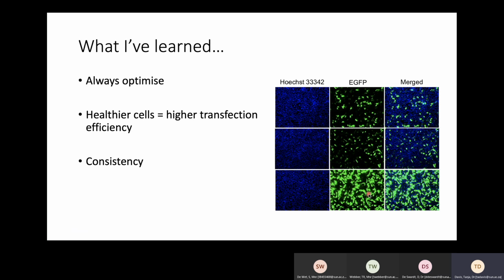Yes, that is actually one of the things that you would most likely end up optimizing. But if you use more plasmid, you will most likely reach a point where you start to stress out the cell. So in this case, more is not always better. For most cases, if you're using a transfection reagent, you can start off using different ratios of, for instance, plasmid DNA versus the transfection reagent. And every cell line would then require a specific ratio.